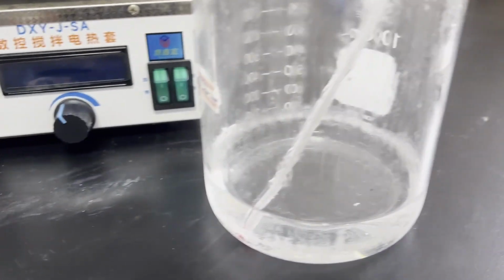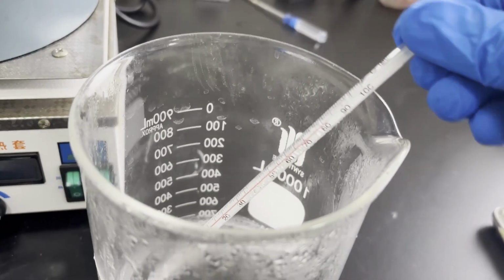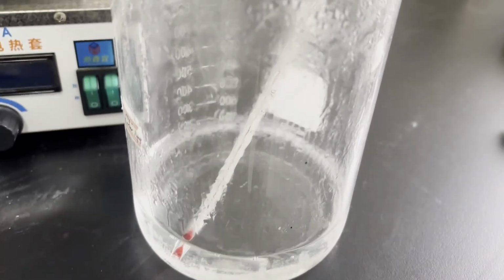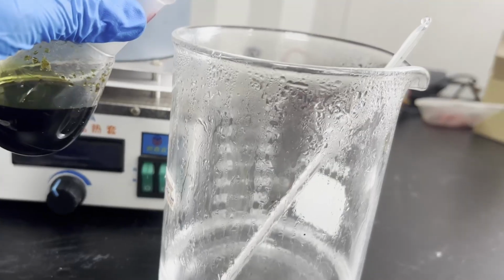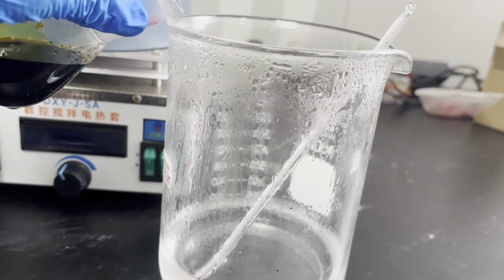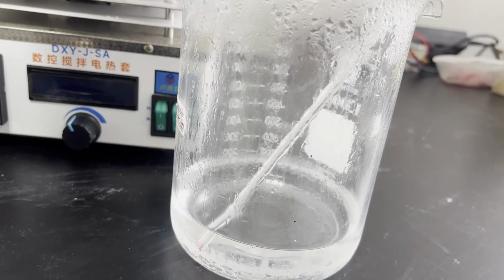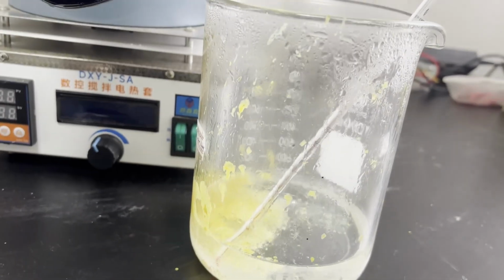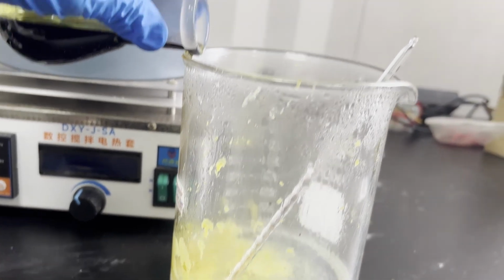Meanwhile, I added around 100 ml of water to a large beaker and heated it to 80 degrees C. The paper called for boiling water, but I found that 80 degrees C water is safer to work with as it reduces splattering. I carefully poured the reaction mixture into water, and as I expected, a violent reaction happened as sulfuric acid releases much heat when diluted with water. A bright yellow solid is formed immediately, which is our product, acridone.